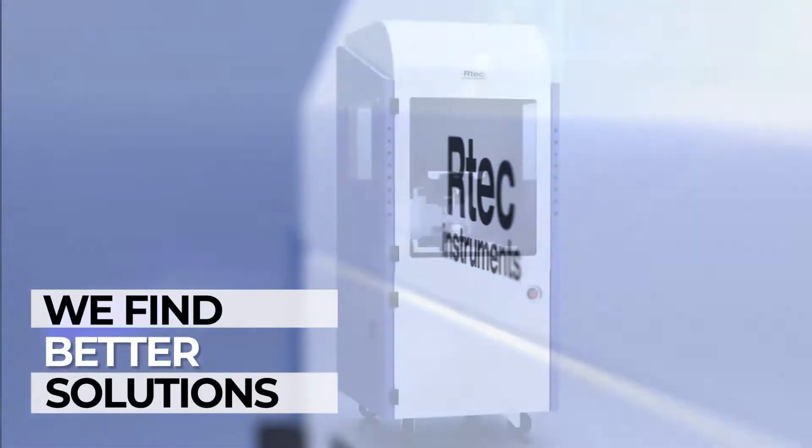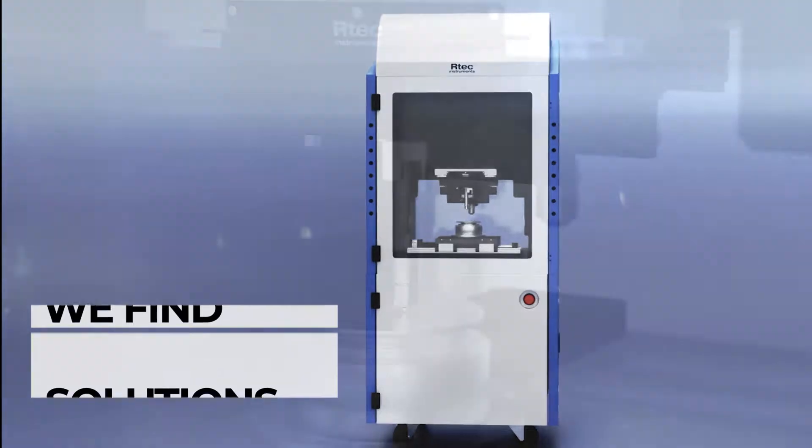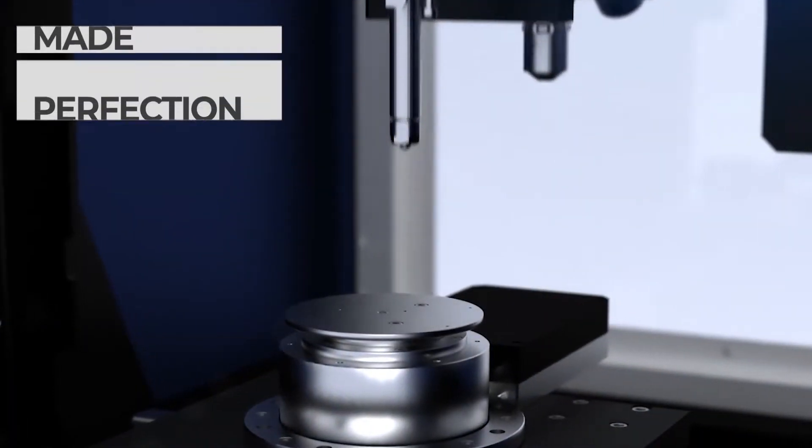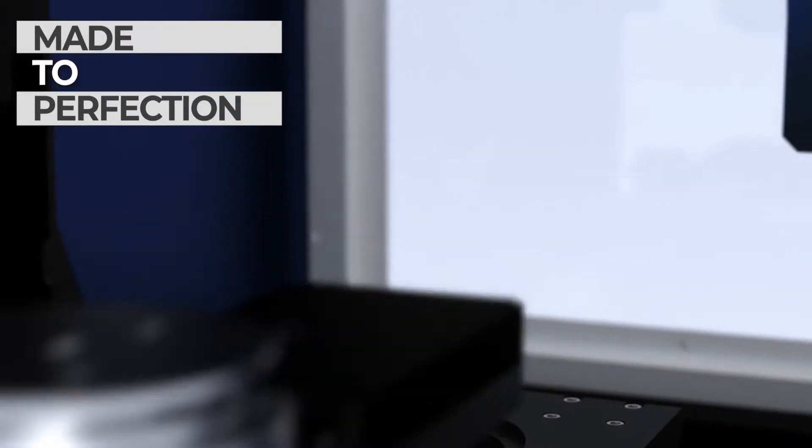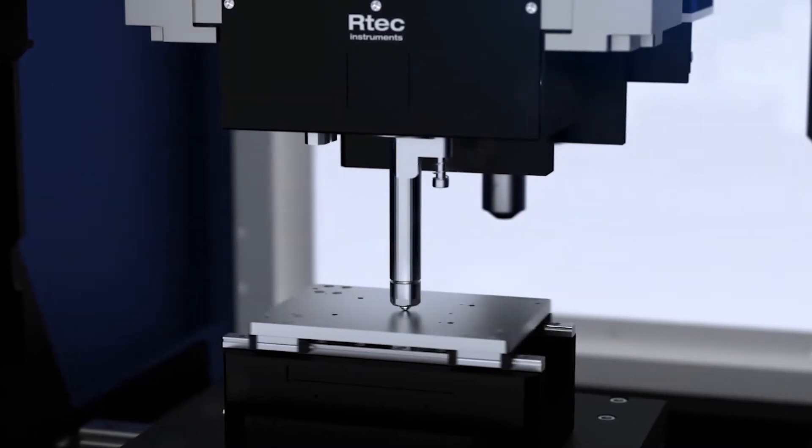We're not afraid to break the mold to provide better solutions. Each component is created and perfected with the highest precision, equipping customers with tools they can rely on.